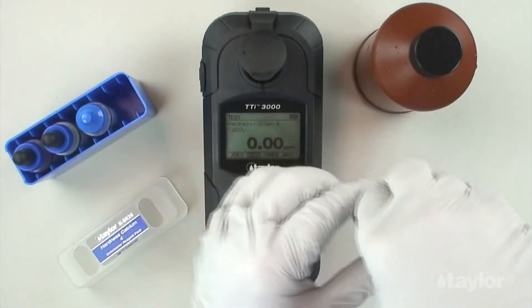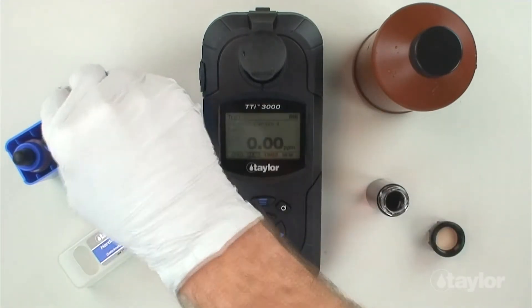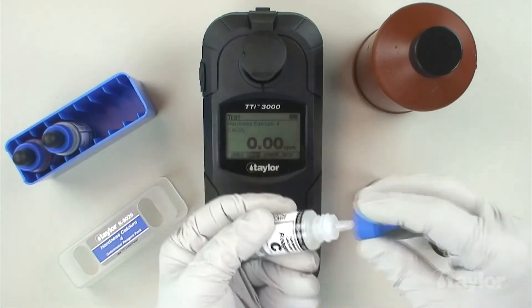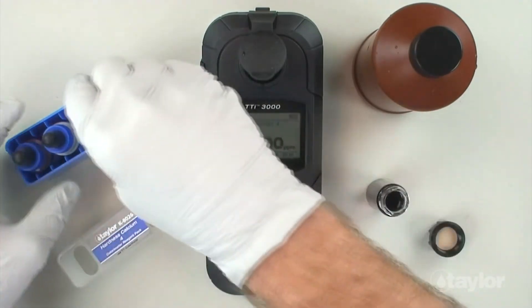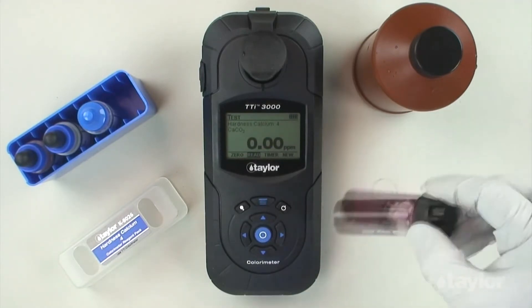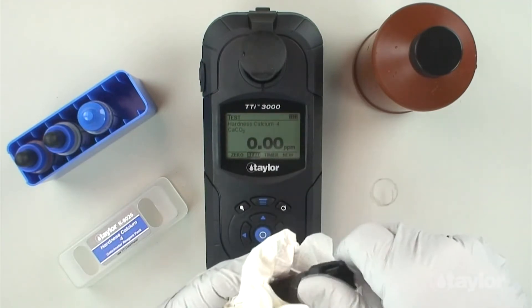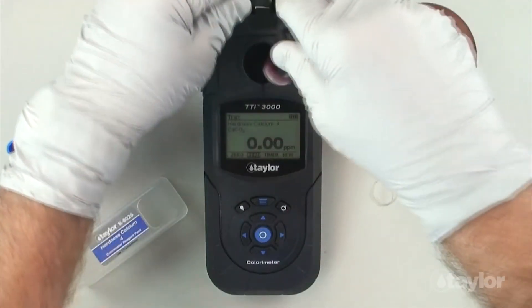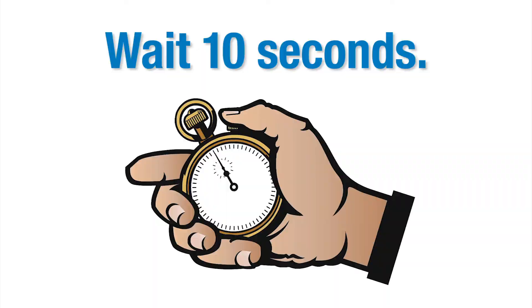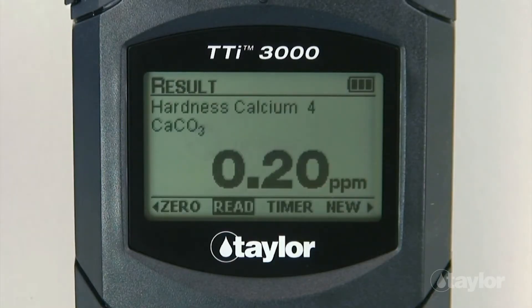Remove the sample cell from the sample cell compartment and remove the cap. Add 2 drops hardness calcium 4, reagent C. Cap and swirl to mix thoroughly. Insert the sample cell into the sample cell compartment. Wait approximately 10 seconds. Select read and then press enter. The instrument will read the sample and the result will be displayed.